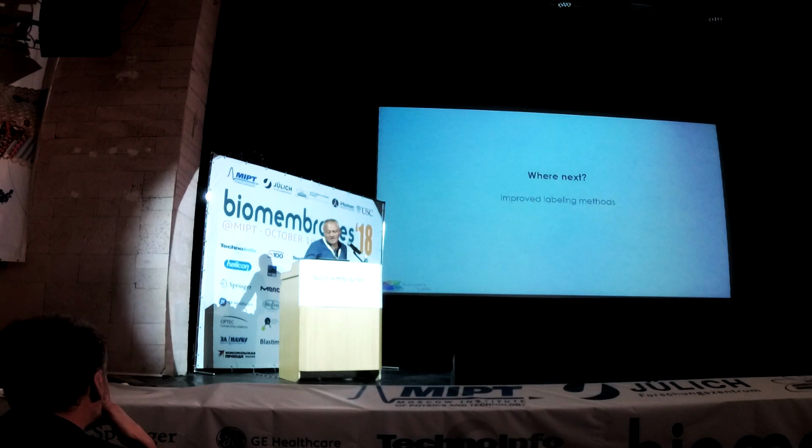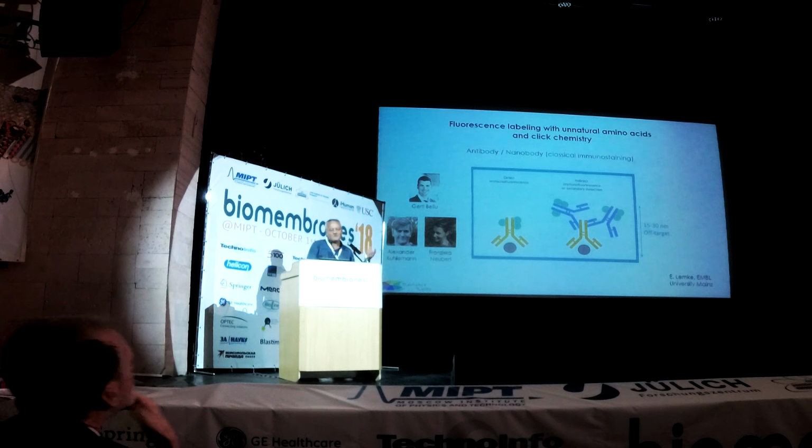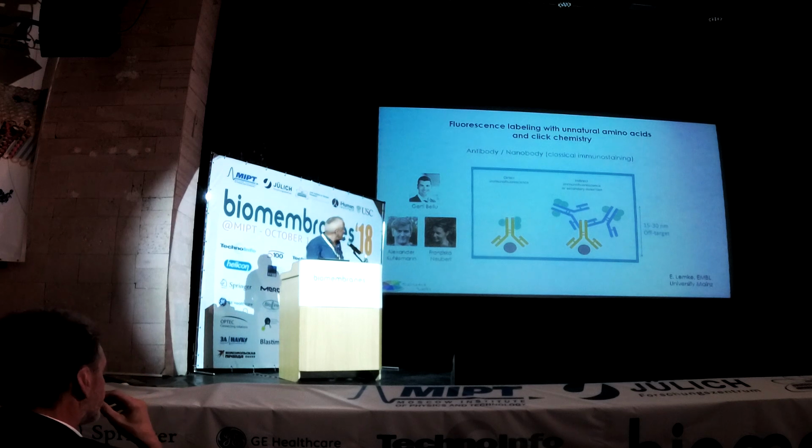But for other proteins you're interested in, it might be useful to use a smaller probe. IgG antibodies have a size of 10 nanometers. If you're using primary and secondary antibodies, you end up with 15 to 20 nanometers. Now, assuming the best spatial resolution we can achieve is about 20 nanometers, this is kind of contradictory.